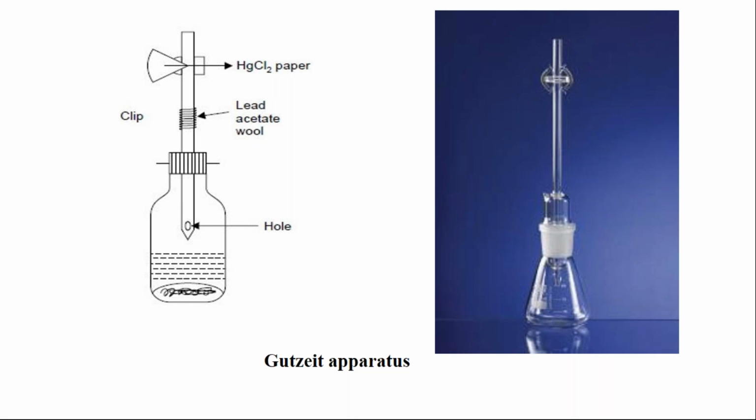As you remember, what did I say is the internal diameter of the glass tube? That is also 6.5 mm. So the rubber bungs which you are using will also have the 6.5 mm hole. One of the bungs is fitted to the upper end of the tube, while the second bung will be kept on top of it. You need these bungs to be stable, in place when this reaction is going on.